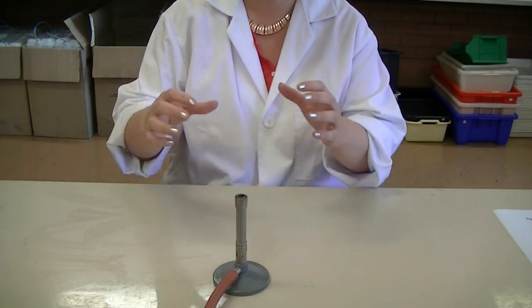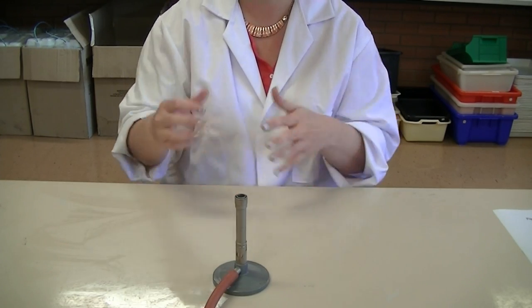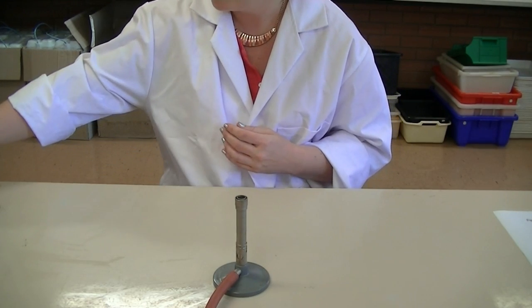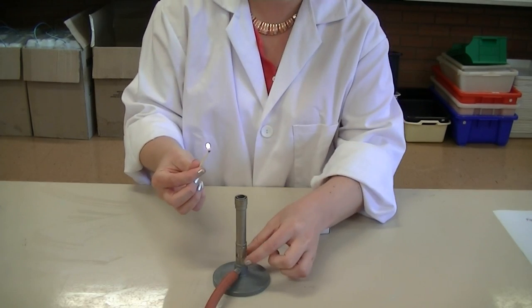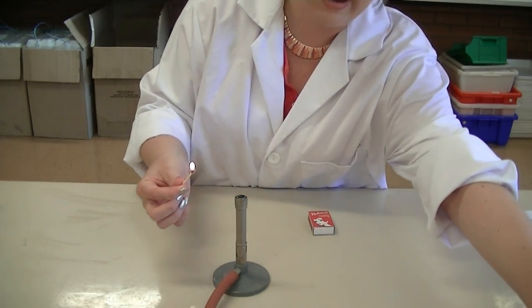When the Bunsen is lit, the flame creates an area of sterility in the air and also keeps the bench nice and clean. You want to light that soon after you've wiped your bench down. Grab your matches, strike your match, ensure that the hole of the Bunsen is closed, and then turn on your tap.